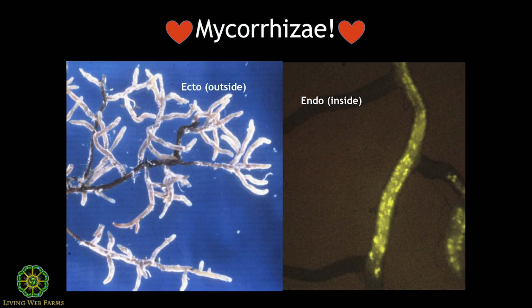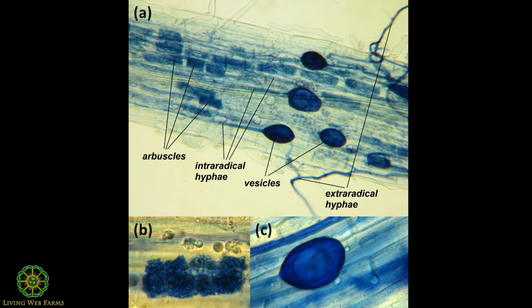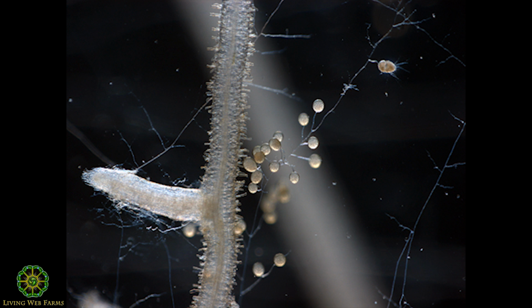You have to have a UV situation going on with your microscope, or you have dyes in order to actually see the arbuscules, which are those little fluoresced bits inside of the root. You can dig a root and wash it in a vinegar solution and then put it in India ink back and forth until it takes up the India ink, and you can look at it under a scope, and sometimes you can see the arbuscule on a plant. That's the one way to see them that I know of, but I've never actually laid eyes on it. That would be very exciting.